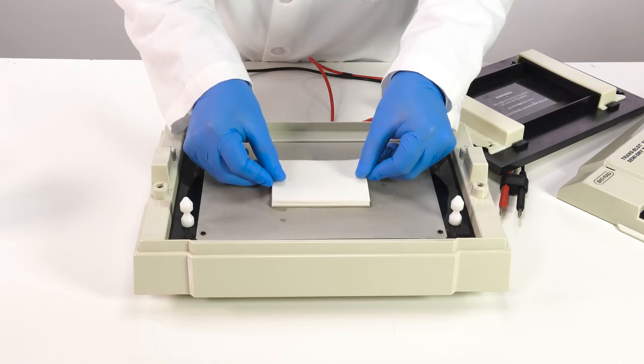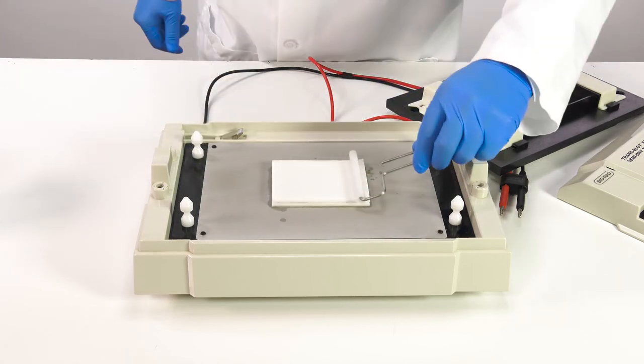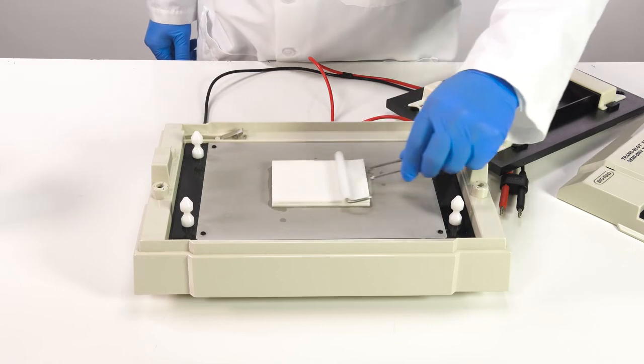Finally, place the other sheet of soaked filter paper on top of the gel. Roll one last time to remove any new air bubbles.